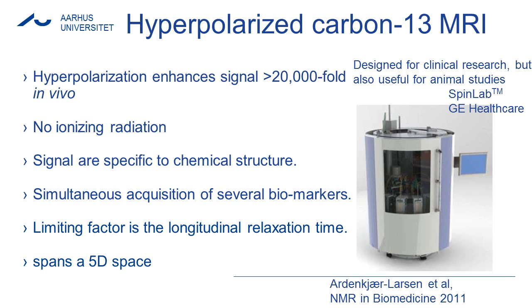The system we use at our facility is a SpinLab from GE Healthcare. It's designed for clinical research, but it's also useful for animal studies.